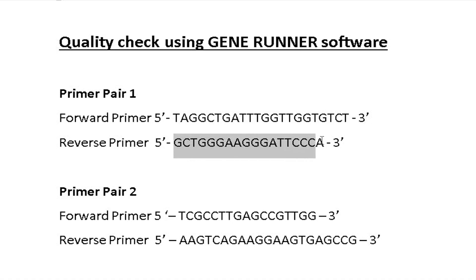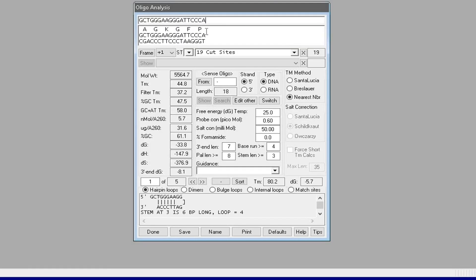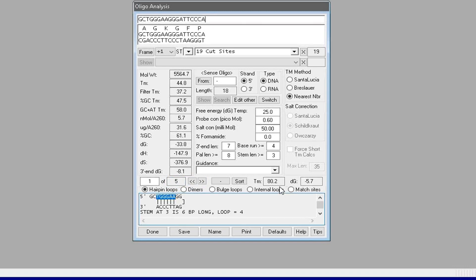Next, to check the reverse primer, select the sequence and paste it in the GeneRunner software. The software detects five different hairpin loops in this primer sequence. These loop formations are a consequence of the nucleotide arrangement in the sequence.